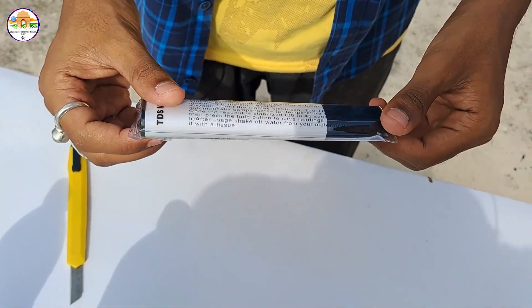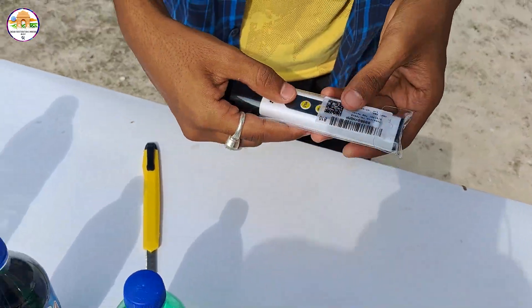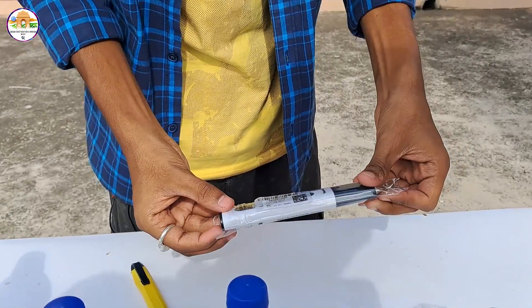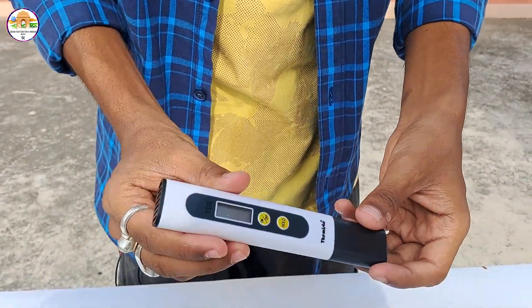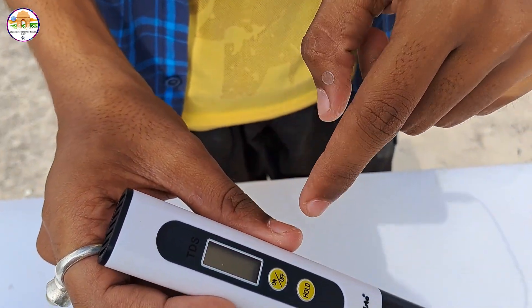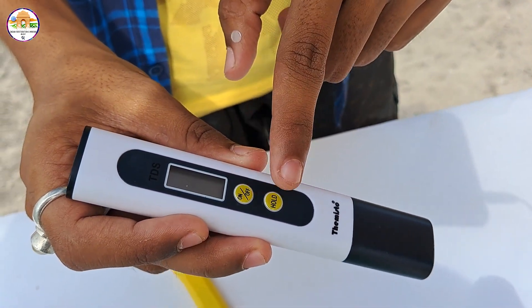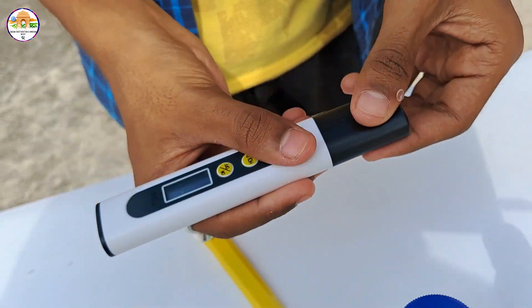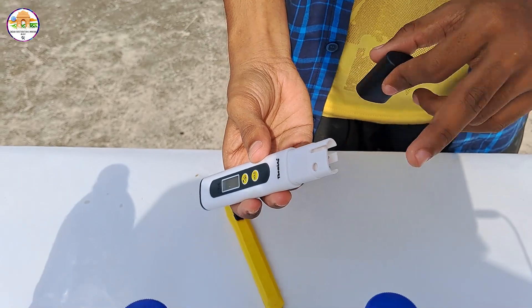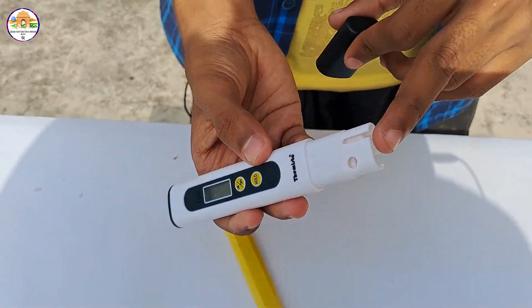This is our TDS meter. Here is a small display, and here is the on/off button and the hold button. This is the cap to open, and here are the leads — this is the liquid test probe.